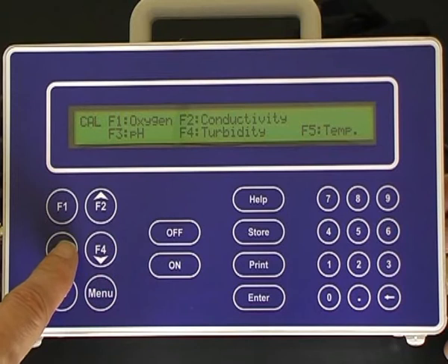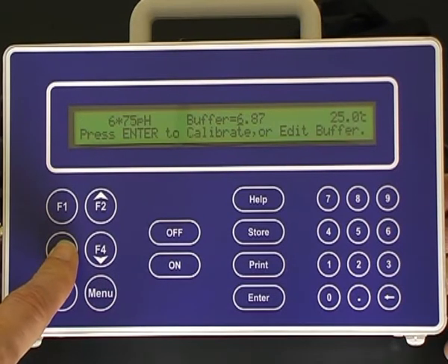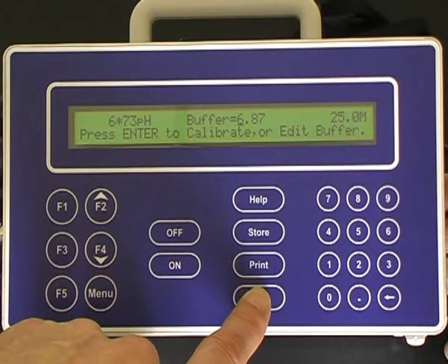Press the F3 pH selection. Allow the sensor to equilibrate to the buffer value. Once it has settled, press the Enter button again for the second point pH calibration.